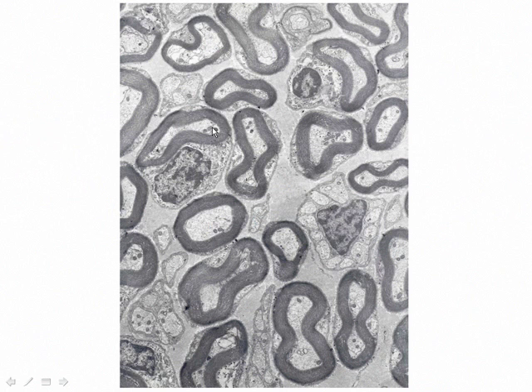In the middle is the cytoplasm of the axon. So this is the cytoplasm of the nerve. And you'll note that within this cytoplasm of the axon, there are small organelles. These are mitochondria, which actually travel up and down the axon to the terminus and back to the cell body. Also, you should note this structure right here.